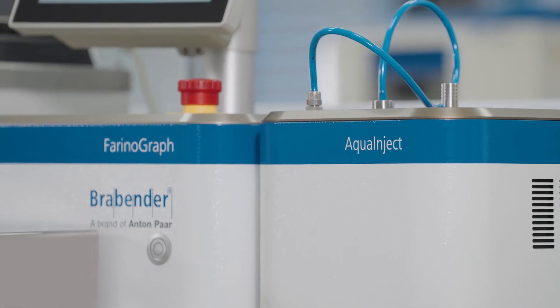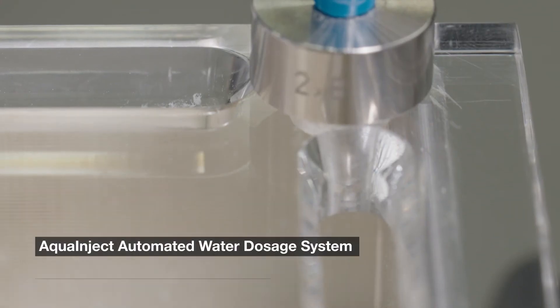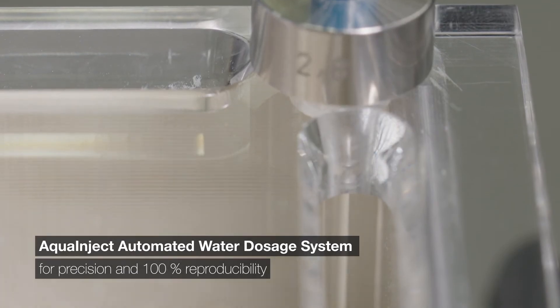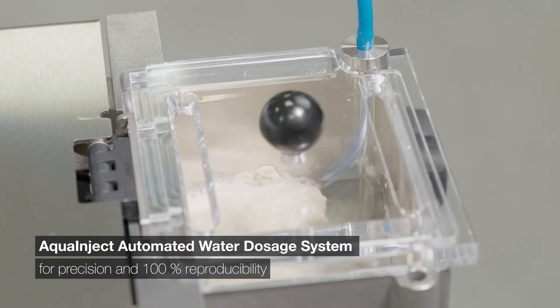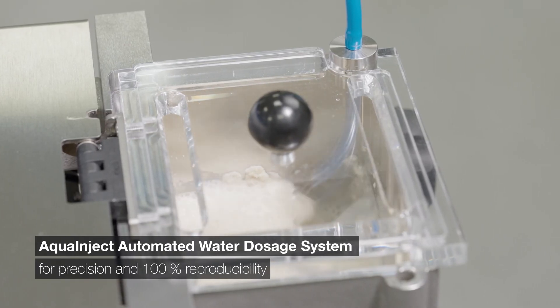Analyzing water absorption and characterizing dough development has never been easier with the Aqua Inject Automatic Titration Module, maximizing precision and repeatability while eliminating cumbersome glassware use in your lab.